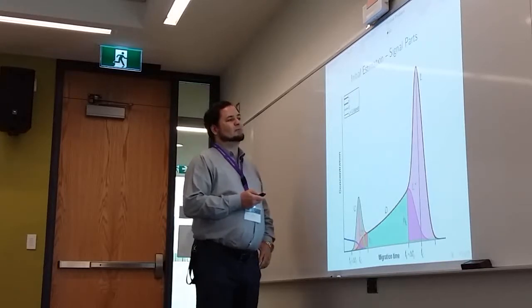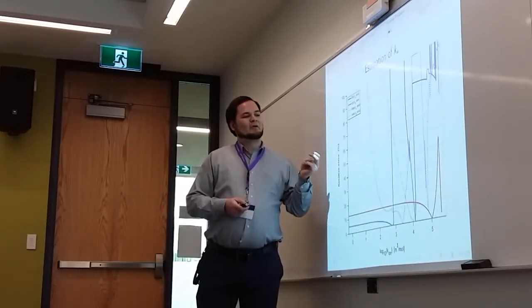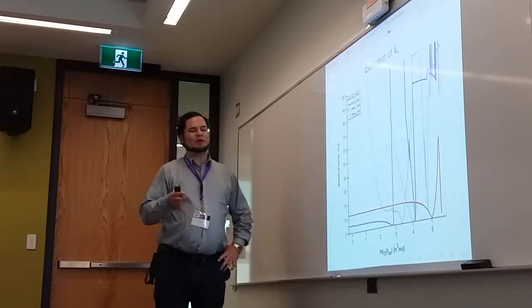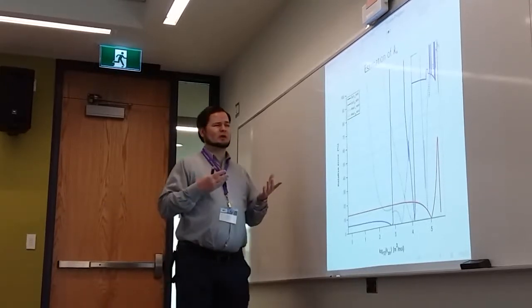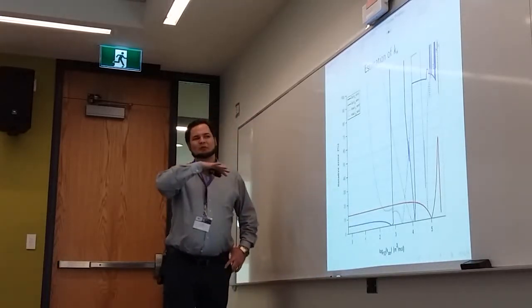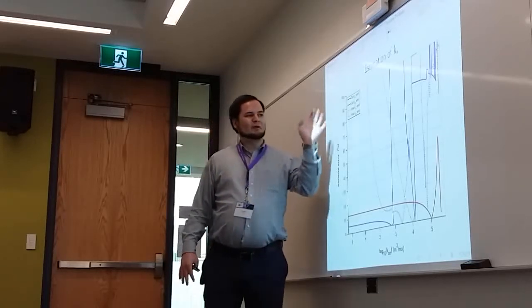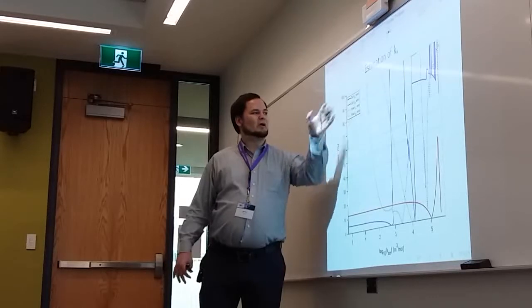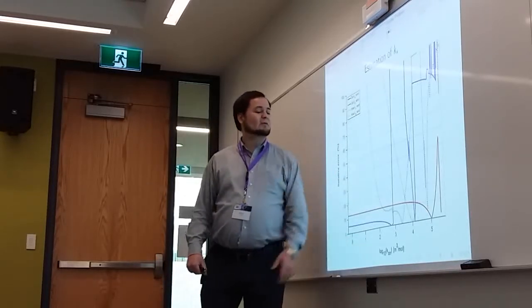But I came up with my own method, which is derivative based. When you have a very noisy signal, you can't really take derivatives. So in order for my derivative based method to work, there has to be some sort of smoothing or filtering of the noisy signal, and then apply this estimation method to get some estimates for K on and K off.